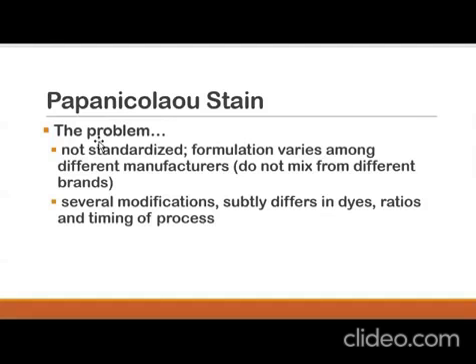Because po, the formulation here could be different from one manufacturer to another. Other formulations could be different. Also, there are times na the procedure as well, iba-iba in terms of time, kung gaano siya katagal i-dip sa isang chemical. So, ganun po. Nag-iiba po yung timing. Okay? Also, aside from the formulations, there are also modifications. But actually, related lang sila. Formulations in terms of the chemical and then modifications in terms of the procedure.